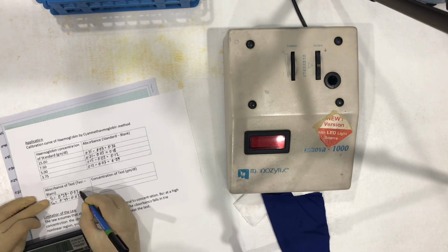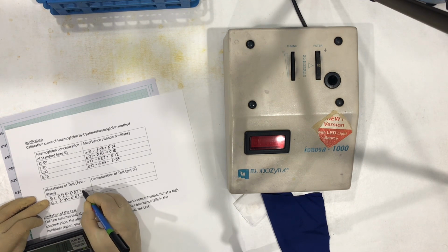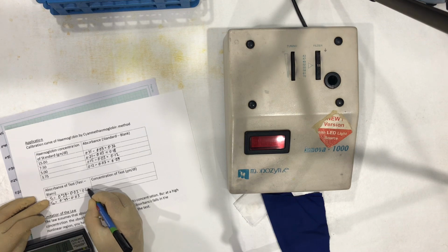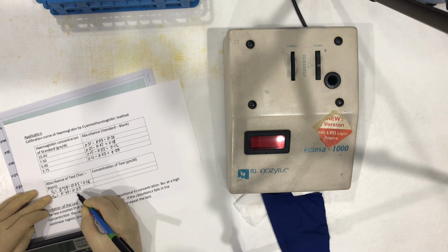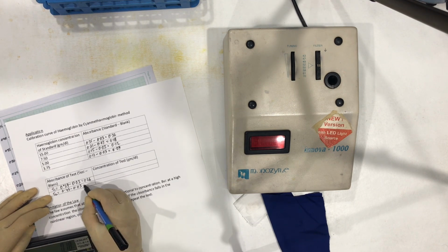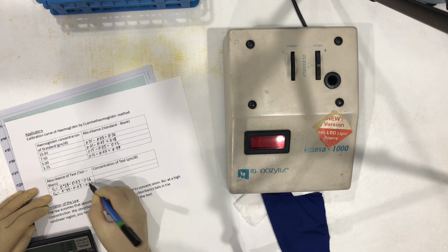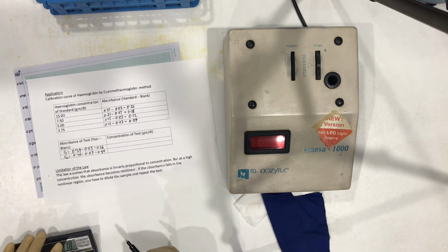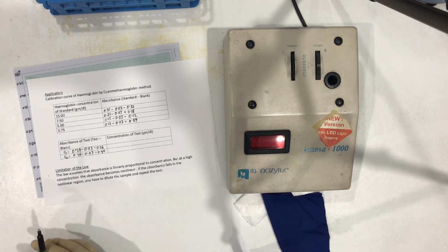The sample 1, that is 0.29 minus 0.03 will give 0.26. 0.43 minus 0.03 will give 0.40. Now let us plot a graph.